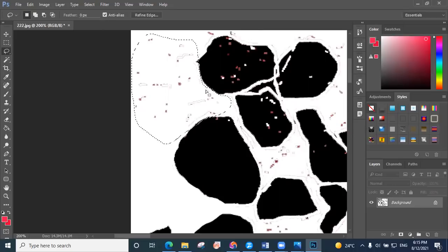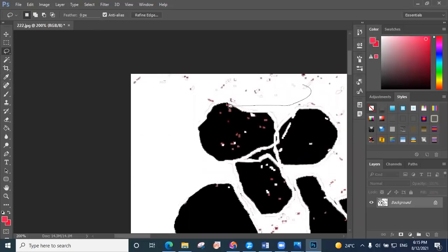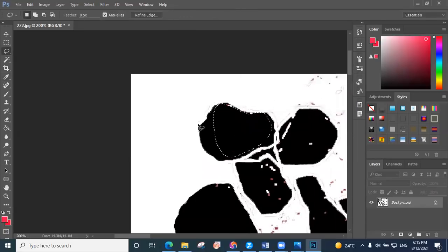Use Excel to filter the values and then choose the size which is acceptable. But it's not accurate, so just follow this method.